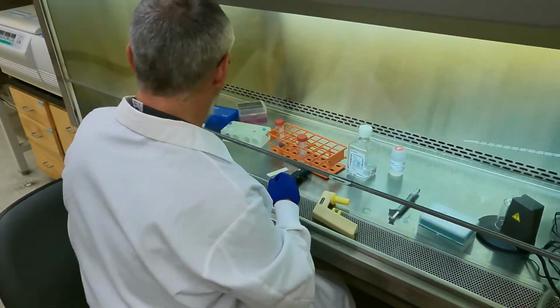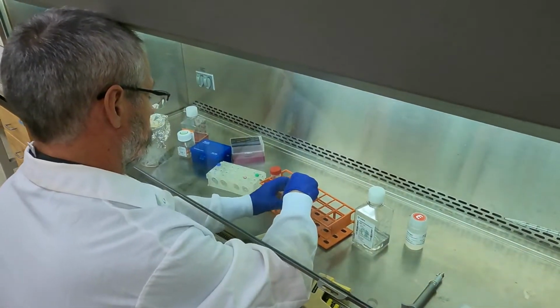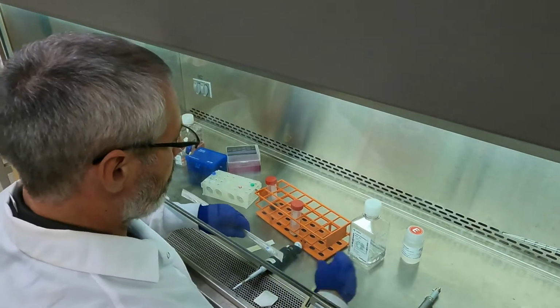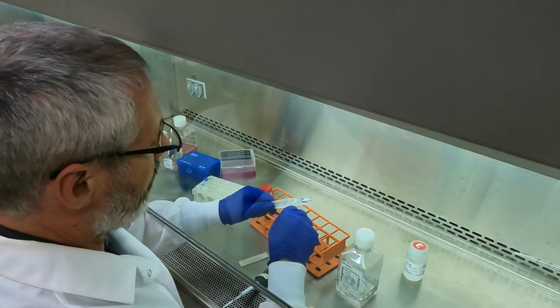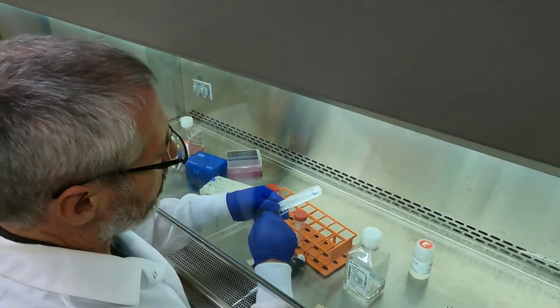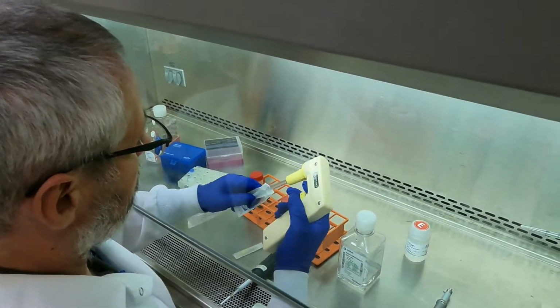So we'll take up in 5. And then if I want 100 microliters of cells at 5 million a mil, I just have to take 200 of this and quickly spin it down, and we'll do that in the main lab.